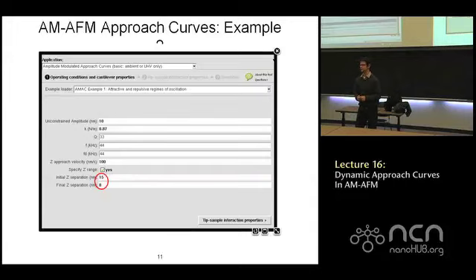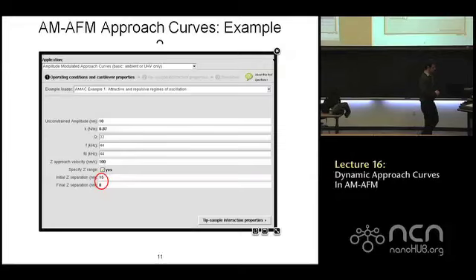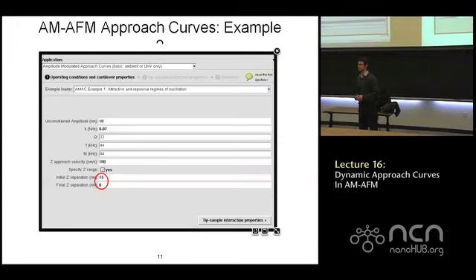For instance, if we were trying to match experimental data to the simulation. That's because I don't really trust the Z piezo measurement so much when we're sweeping over large ranges. It's better when we're imaging and having very small changes in the Z position, but not when we're sweeping over 100 nanometers or something very quickly. But if you have a closed loop Z piezo, that's much better. Under that, if you do the static force distance curve and you do the simulation and you finagle the parameters a little bit, then you should feel pretty good about that part of it.